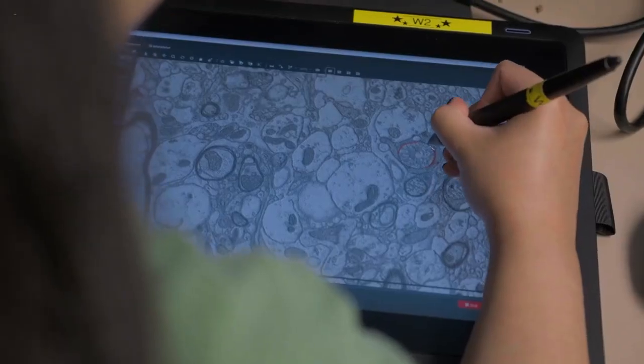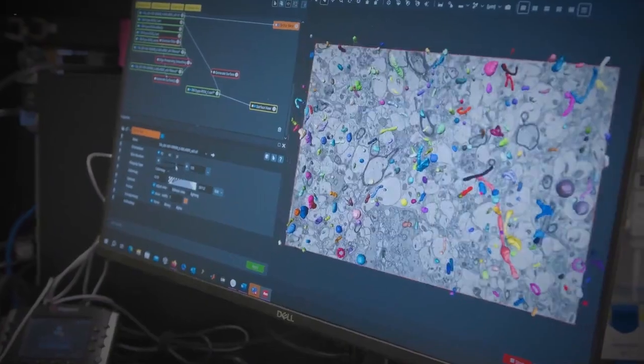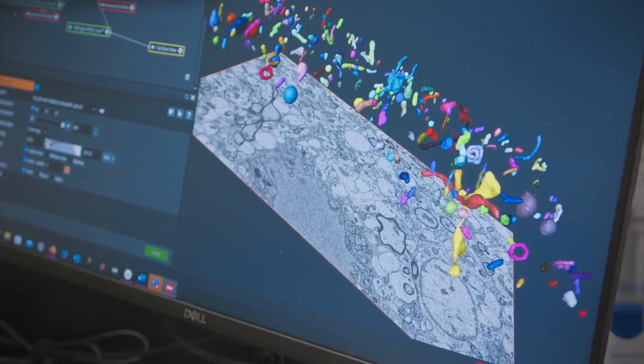Who knew that mitochondria had more than one form and function, right? Because 20 years ago, if I was to tell you that there were 8 different mitochondria and how they look in their structure, you would have told me I was crazy. Now I can show you that I have evidence that this is happening.